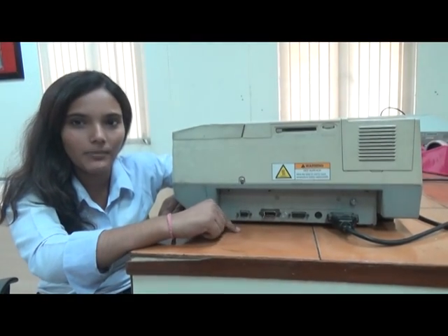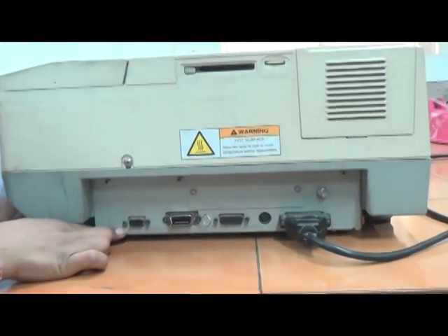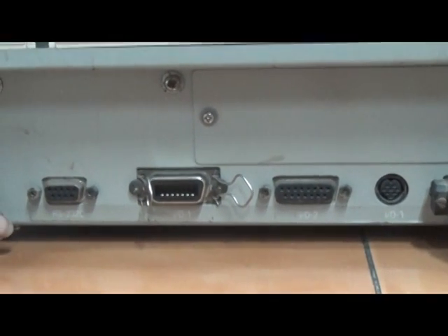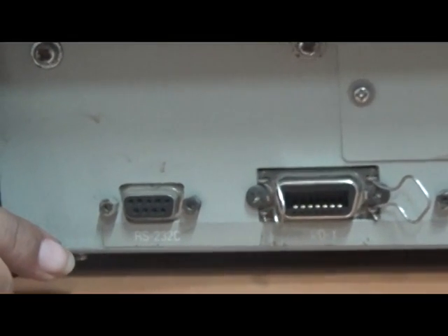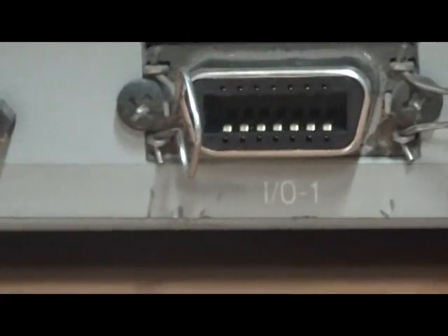Now I will tell you about the right side view of the spectrophotometer. First one is RS232C. This is a standard RS232C interface. This can be used to connect an optional printer or a computer equipped with a standard RS232C interface.